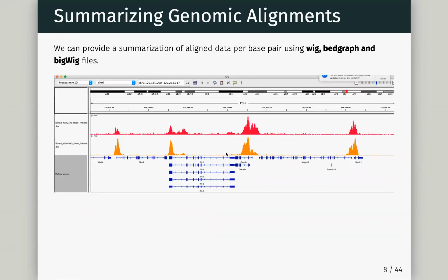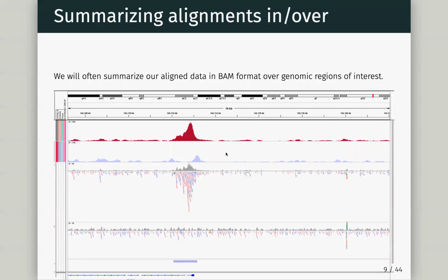So far, we have a few different ways of reviewing our data, and hopefully you've seen that one of the best ways we can quickly review signal over a genome is using a bigwig. Right now, we haven't produced a bigwig, I think. But we have imported them, we've got them from ENCODE, and we've learned how to manipulate them a bit. And we know that we can look in IGV. In this case, we're probably just seeing signal over the beginning of genes. But once we've got it in IGV, it's super easy just to move back and forward and get an idea of how the data looks.